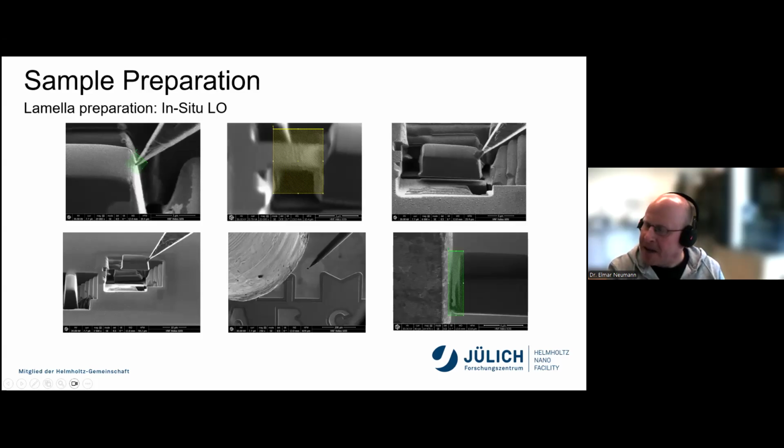Then a lift out needle, again with I-beam, is welded or glued to the sample.